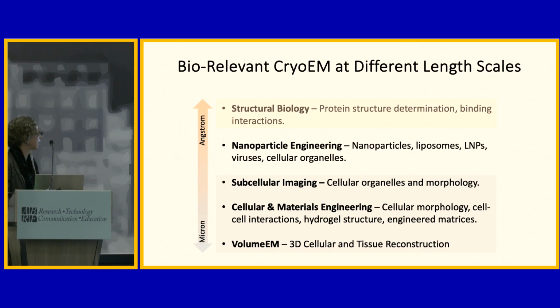This can include looking at nanoparticles and engineered drug delivery. This can look at subcellular imaging or perhaps cellular imaging in the context of the materials that they are growing in. If anyone attended Kirk Zimick's talk earlier, expanding into the volume EM space where we're now looking at 3D cellular tissue reconstruction, even all the way up into the connectomics world where you're imaging an entire Drosophila brain, just amazing expanses of data that are generated. And so we really focus on this area, but we also generate some sample processing and prep that feeds into more of the structural biology.